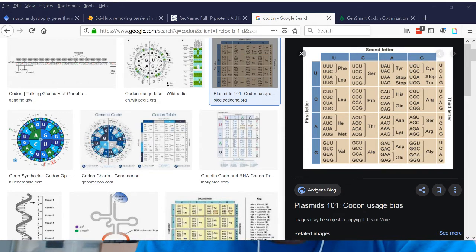All right. So the next best thing is just finding pcDNA with some other genes in it that we can just get removed. All right, this plasmid is not highly annotated at all.